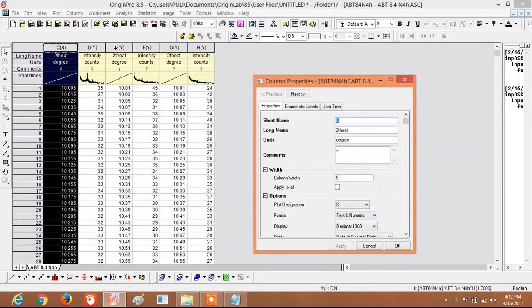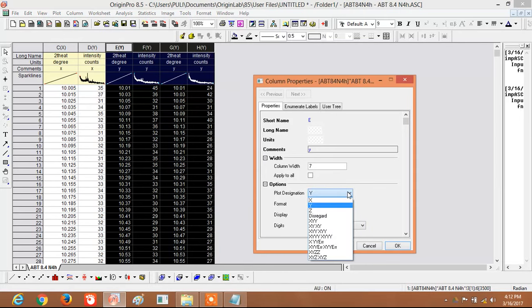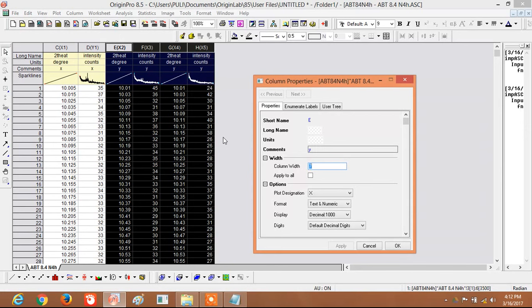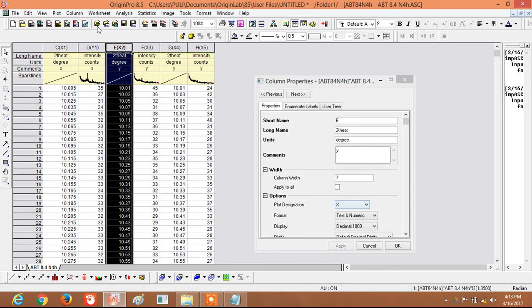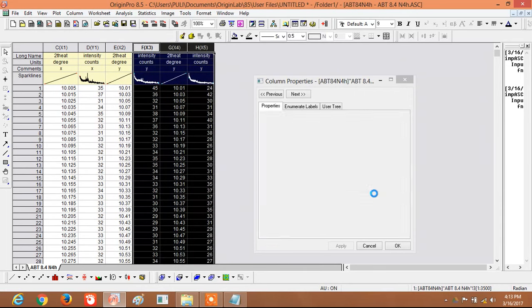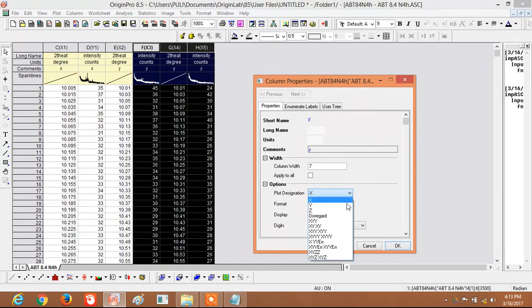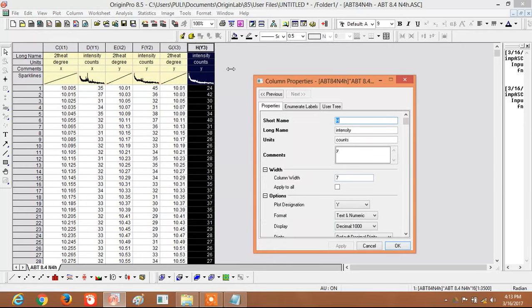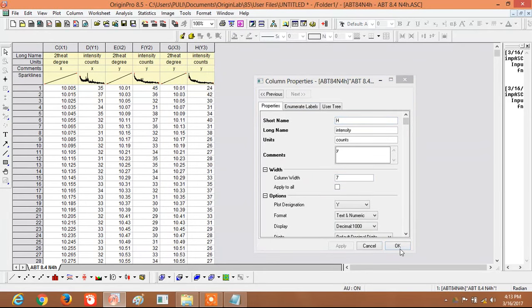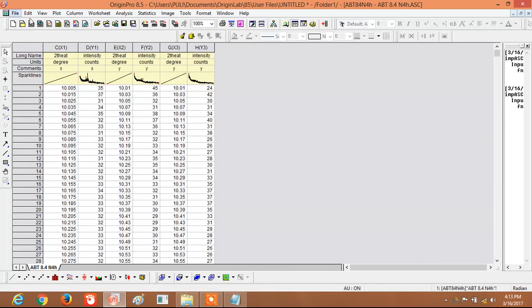Select only the X axis option for the Two Theta columns. Make sure all Two Theta values are set to X-axis and all intensity values remain on the Y-axis. Now all axes are correctly configured.